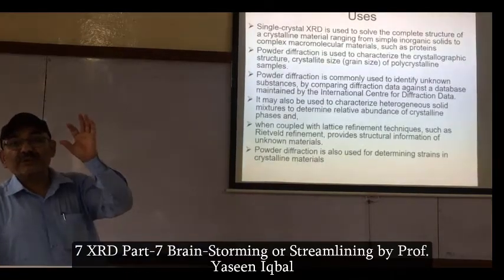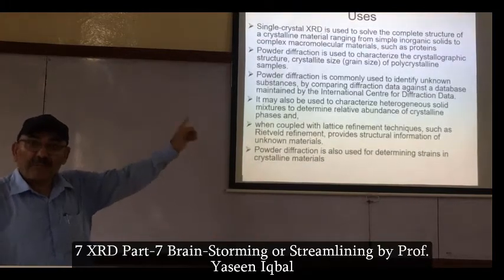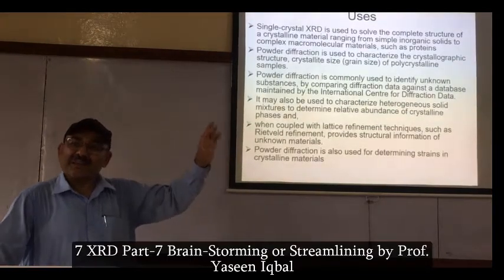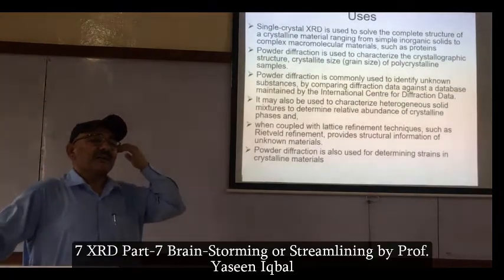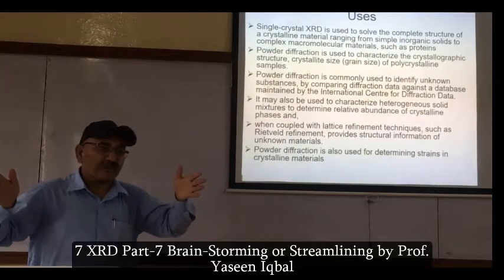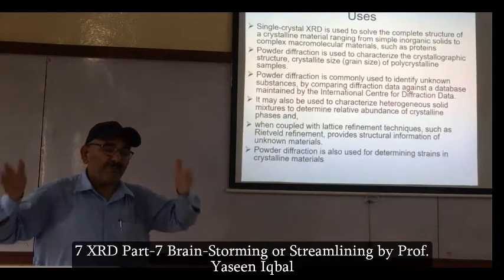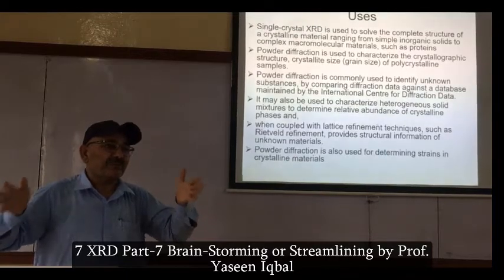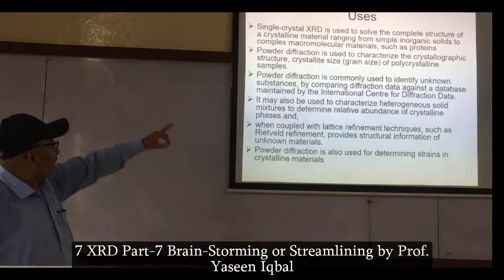But X-ray tells you not from chemistry in this case, but from the diffraction data, where the X-rays were diffracted and what the orientation of different planes with respect to one another is, and how much is the interplanar spacing between consecutive planes, right? I'll show you some planes later.